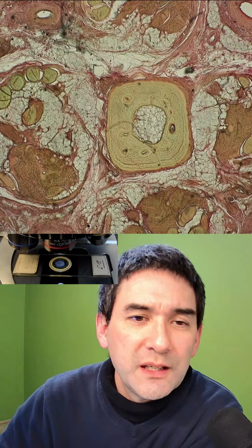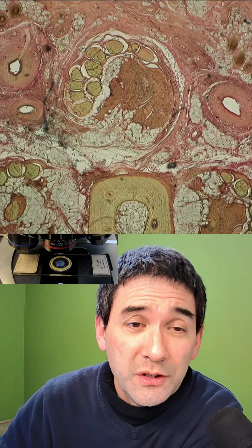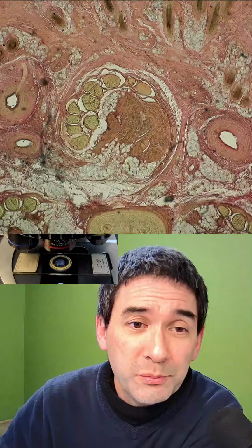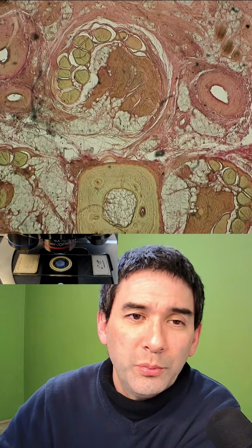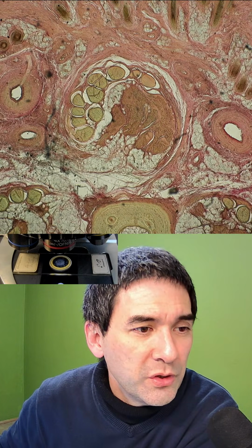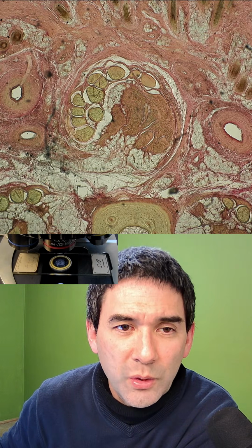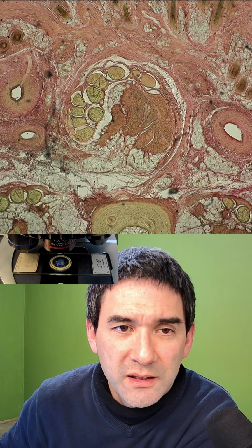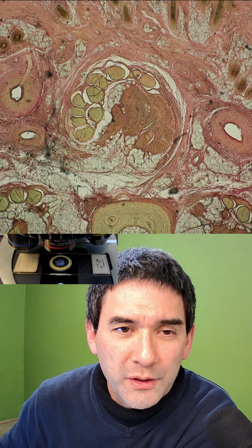What we've got here in the center, for example, that's the cross section of the bone. On the top, I always move it down to the center, these are muscles and tendons for moving the tail. So you've got here on top one of them. Maybe I will show it to you with the arrow over here. So that's one set of muscles, and these things here, these are tendons that connect the muscle to the bone, cross section.